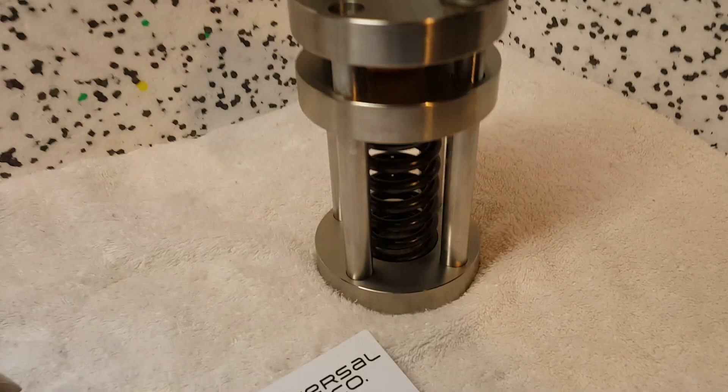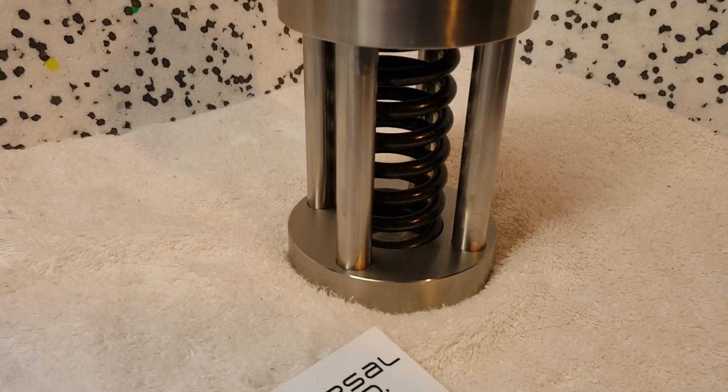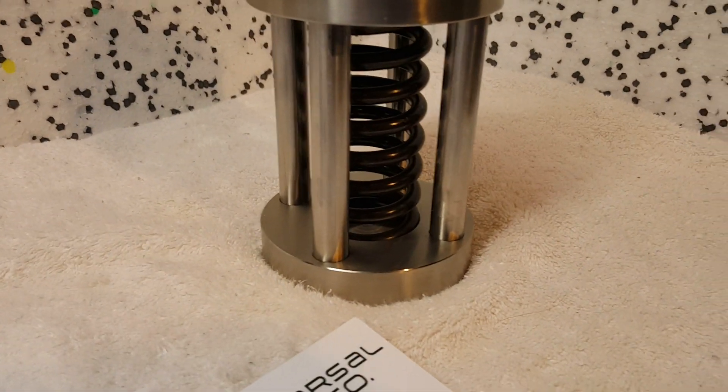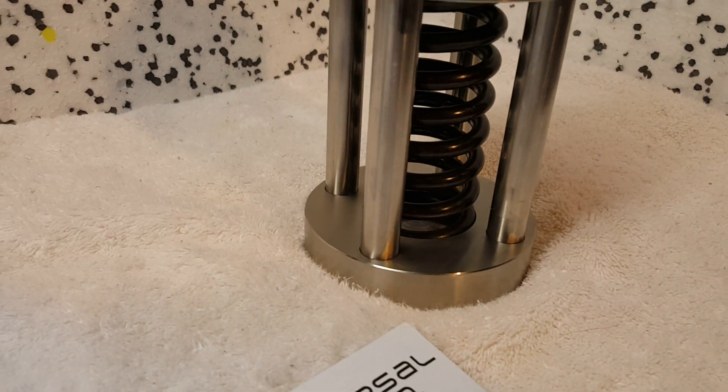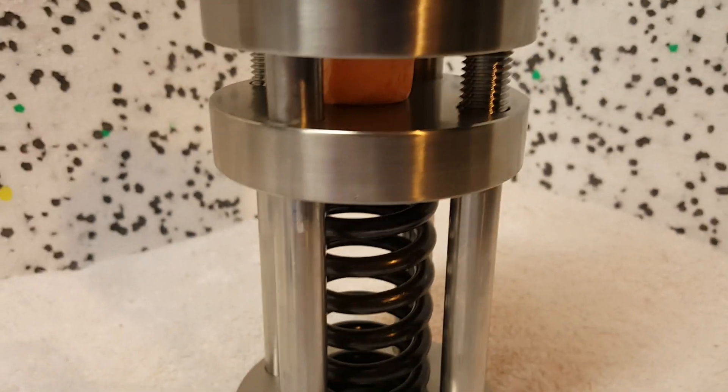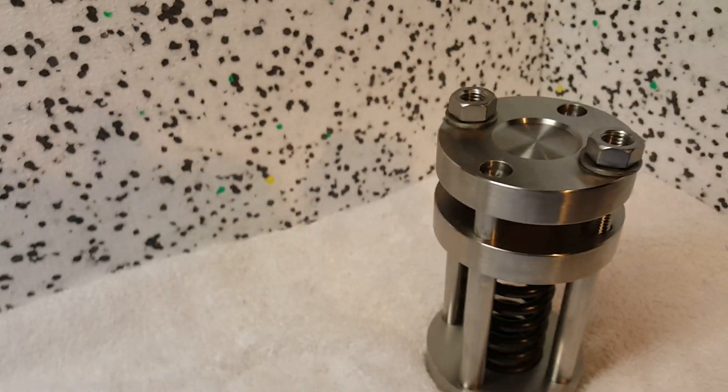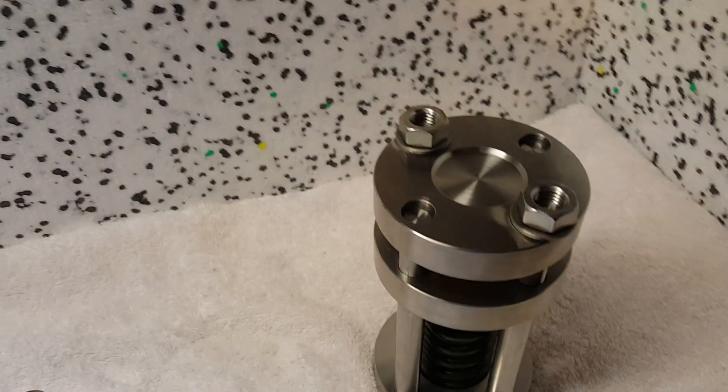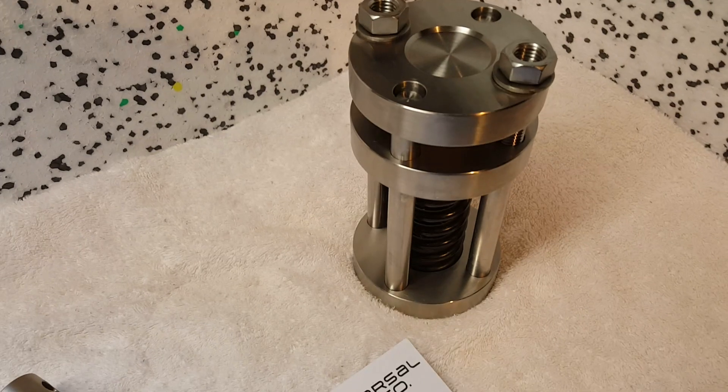You can see the spring here will be tensioned to the very specific amount according to the ASTM standard. I also have the larger ASTM sample mounted in there.